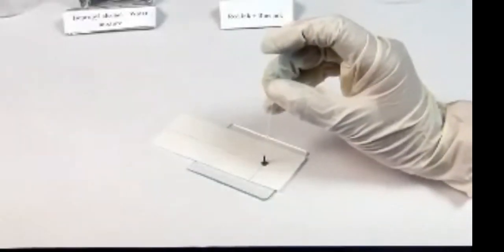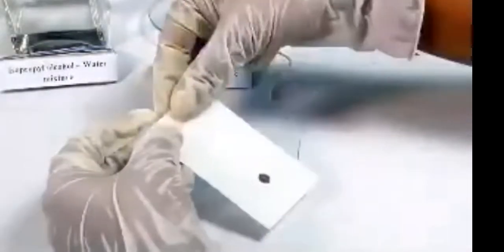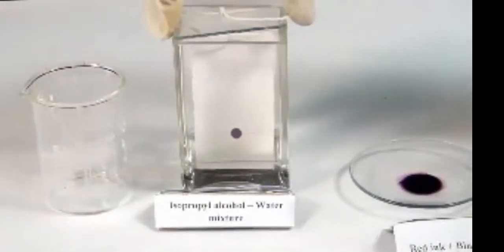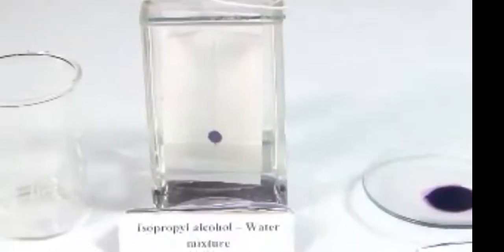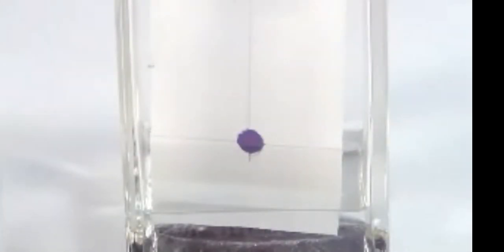Allow the drop to dry in open air, then put another drop on the same spot and dry again so that the spot is rich with the mixture. Take a piece of thread and tie the filter paper to it. Suspend the filter paper vertically in the chromatographic chamber containing the solvent — a mixture of isopropyl alcohol and distilled water. Make sure the pencil line remains about one centimeter above the solvent level. Keep the chamber undisturbed and notice the rising solvent carrying the red and blue inks.